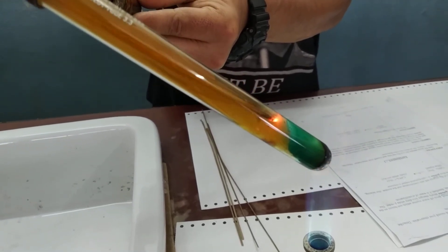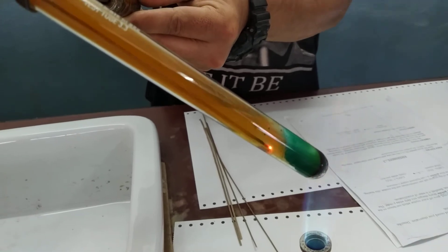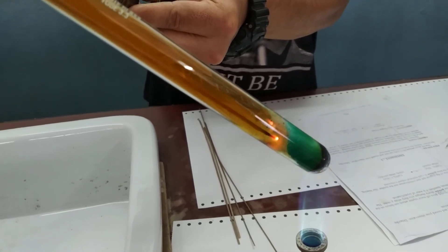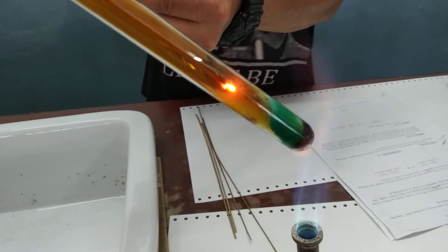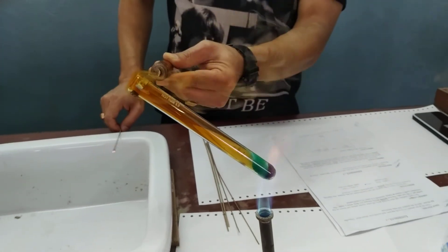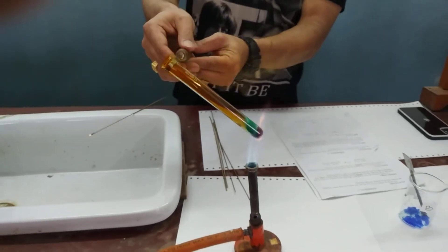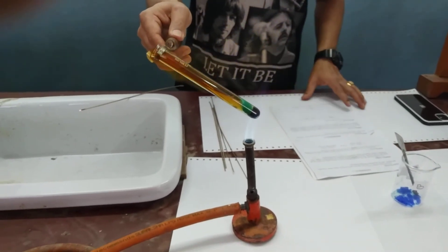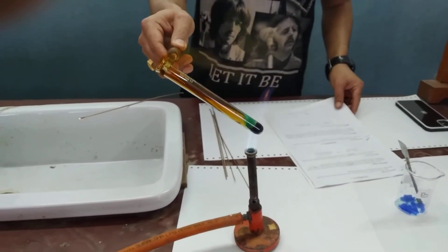If you observe carefully, the glowing splint is rekindled and glows brighter because oxygen gas is given off. The brown fumes are nitrogen dioxide.